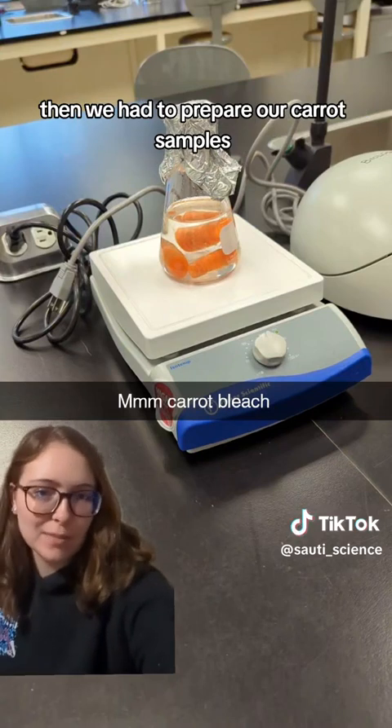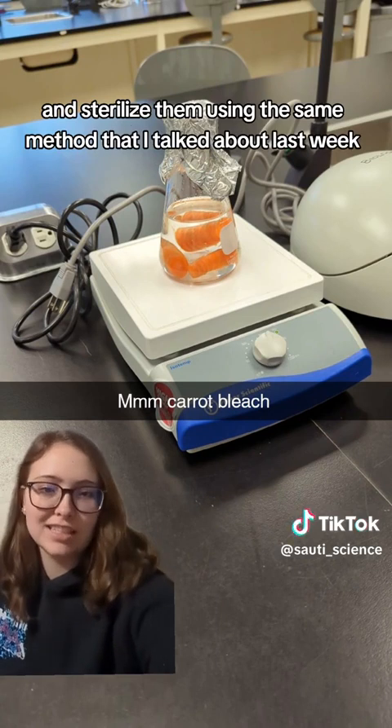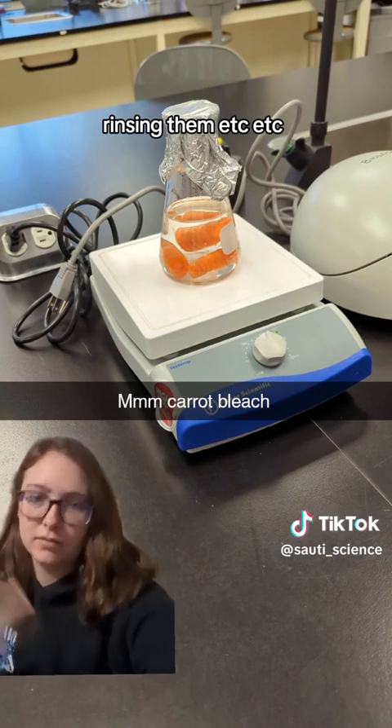Then we had to prepare our carrot samples. We just chopped them up and sterilized them using the same method I talked about last week — soaking them in bleach, rinsing them, etc.